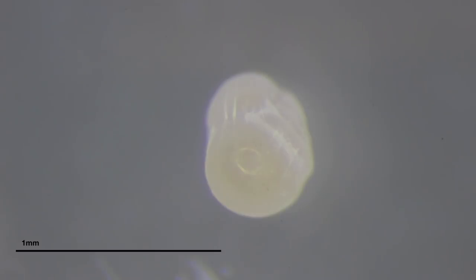They're all tightly curled around the abdomen. But still, look at that. That's pretty. I think I'm going to try and get a closer look at that. This is at 40x right now, but we can zoom in even more.